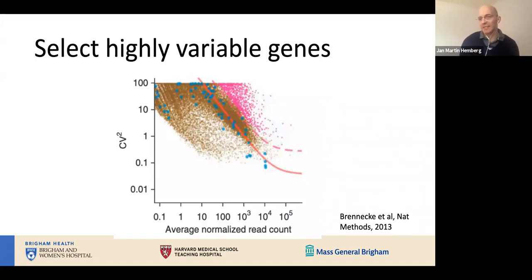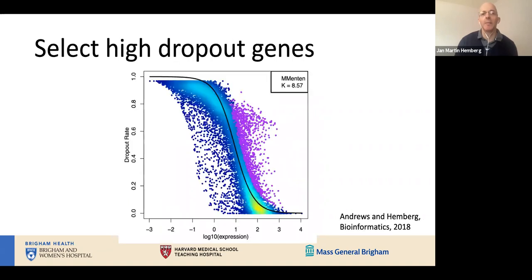So you may have to ask a senior postdoc in your lab what they are and why they're useful, but they've really fallen out of favor these days for various reasons. Hence, I'm not really talking about them. But these are supposed to be negative controls, and as you can see here, none of them are highly variable, which is a nice confirmation.